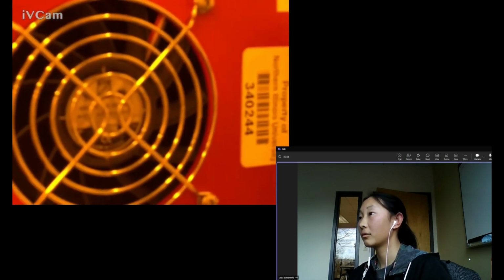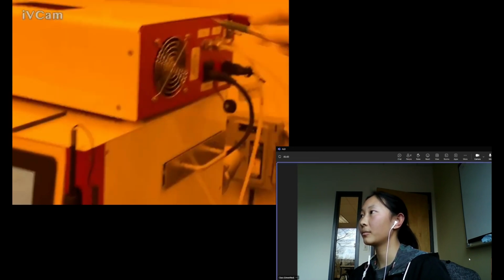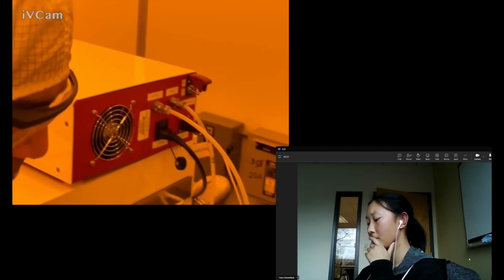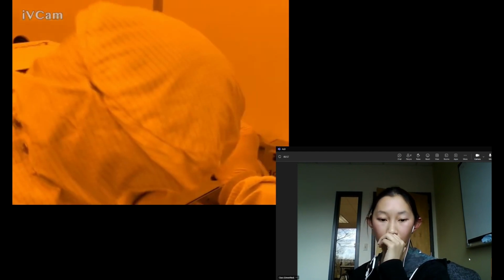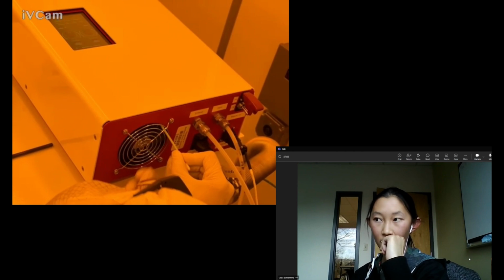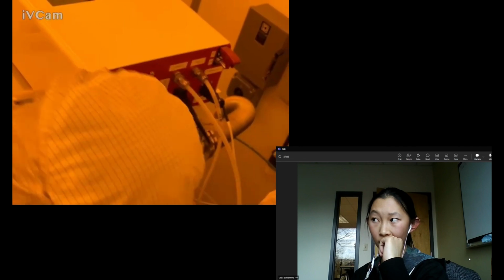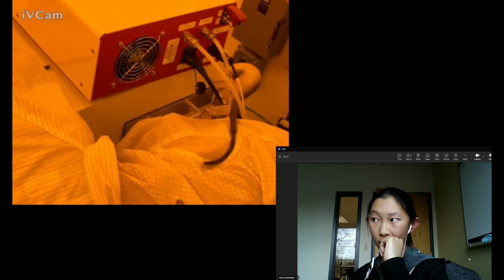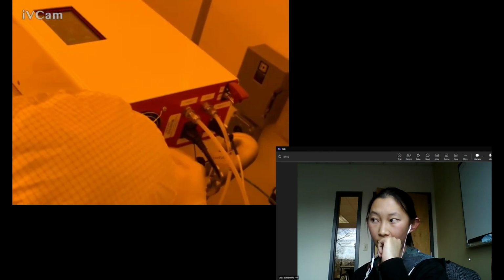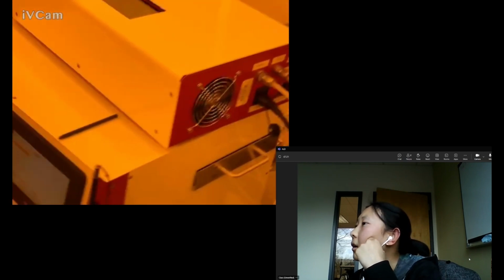You could try. But I feel like it's strong enough. Maybe that is okay because it's just a design. Yeah, it's not turning.